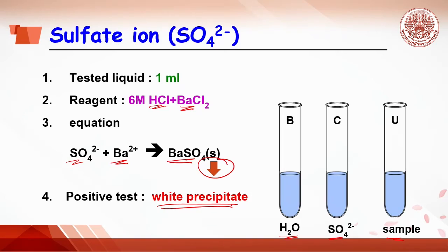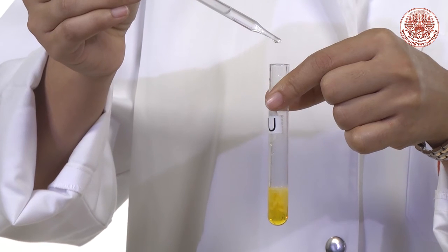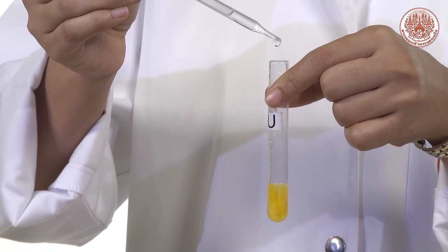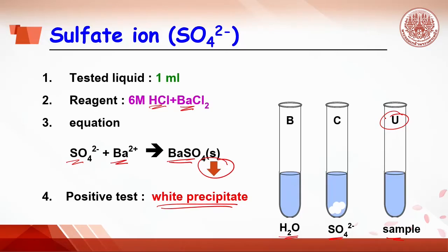The positive test will be white precipitate. Look carefully after barium chloride is added into the U tube. If the sample contains sulfate ion, white precipitate will be formed. If no precipitate, it is negative, meaning no sulfate ion in the sample. Keep in mind, the amount of precipitation might not be equal due to the difference in concentration of sulfate ion.